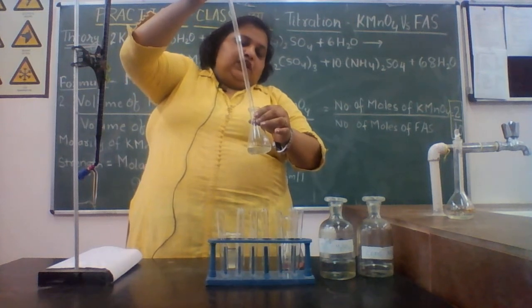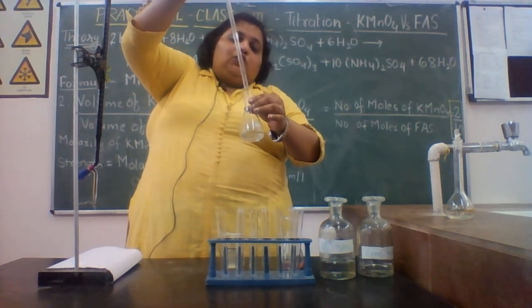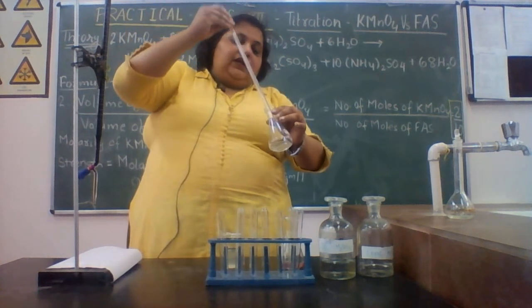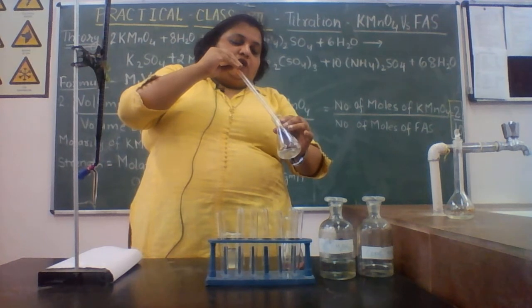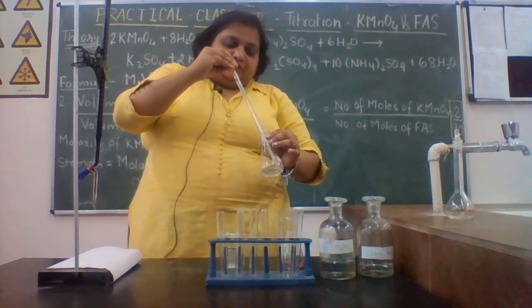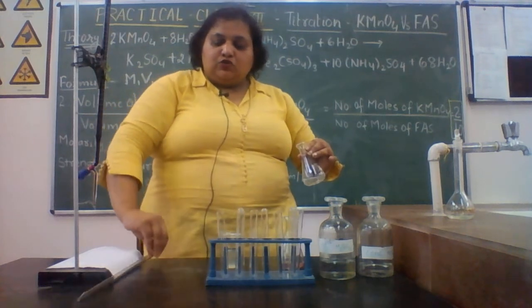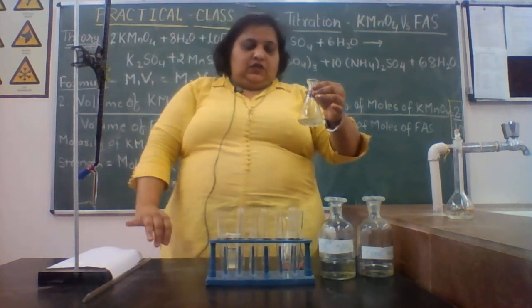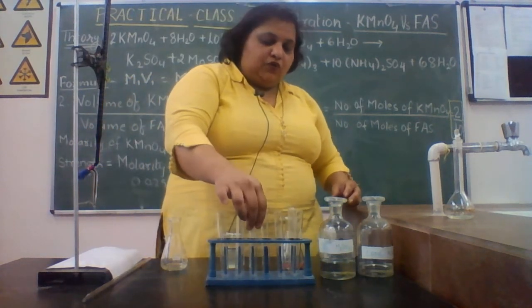See it carefully. Now, you can see one drop is left here. So, do not blow the air. The right way is just to touch it with the wall of the conical flask. Now, this last drop will also go to the flask. Now, what you have to do?